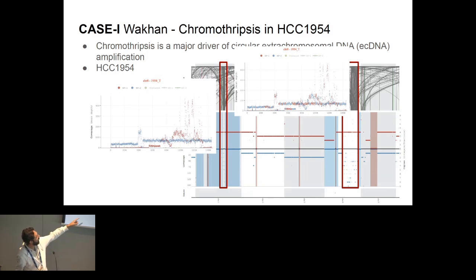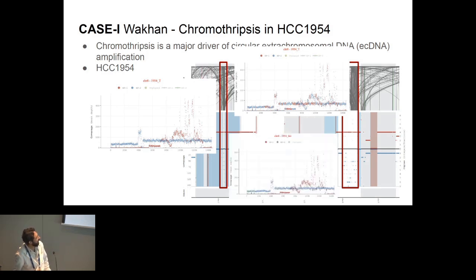And this is the result of our phase correction, where we can easily see only one haplotype is impacted, compared to the other haplotype which has so many fluctuations. This is the Hi-C result, and you can compare both. We are producing almost similar phasing as compared to Hi-C and Pore-C data sets.